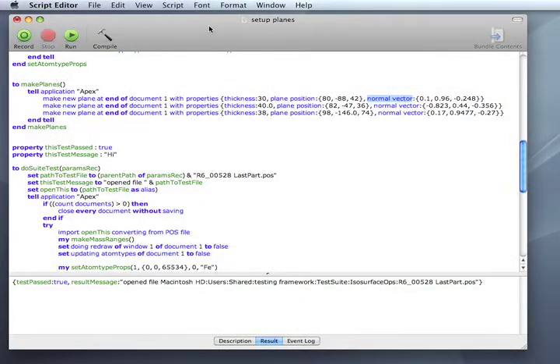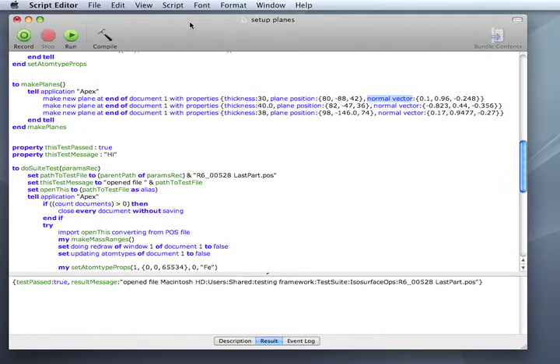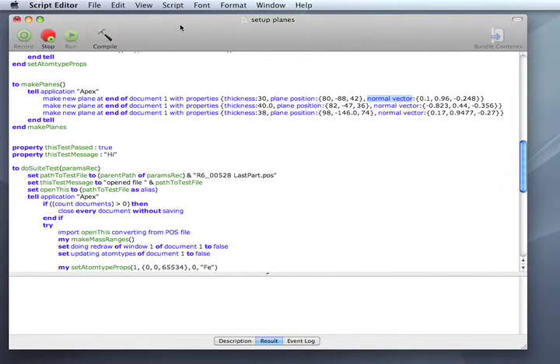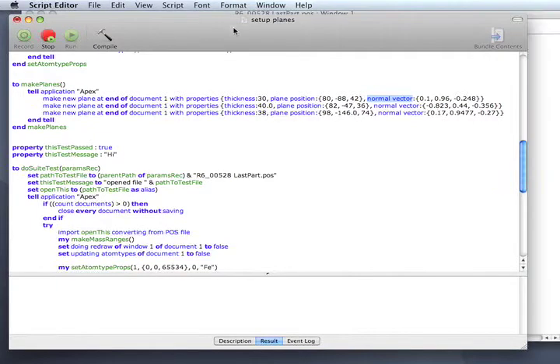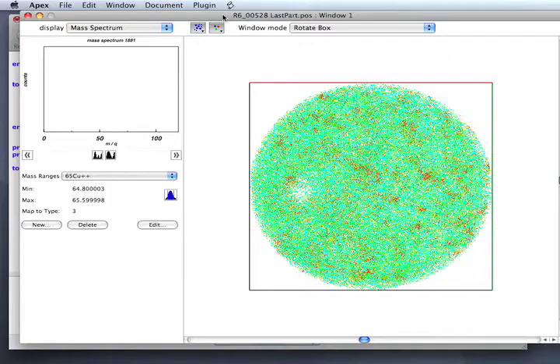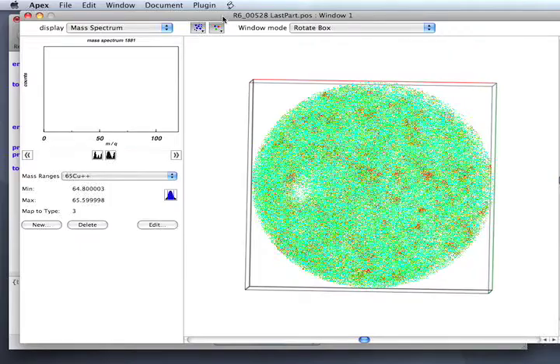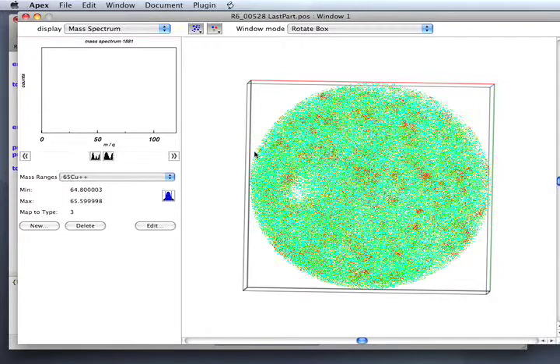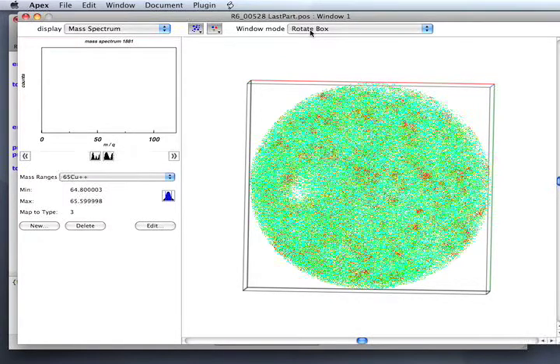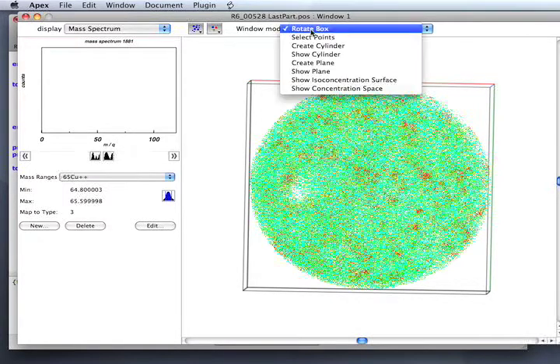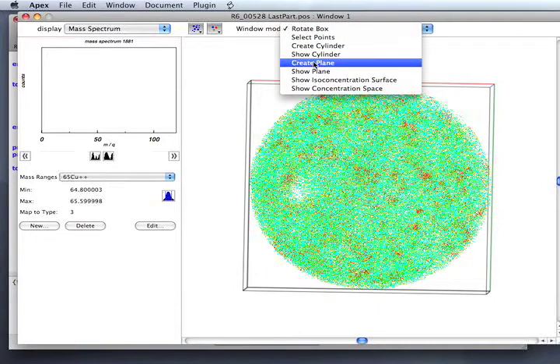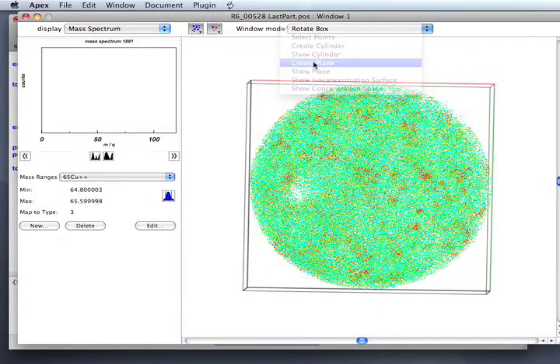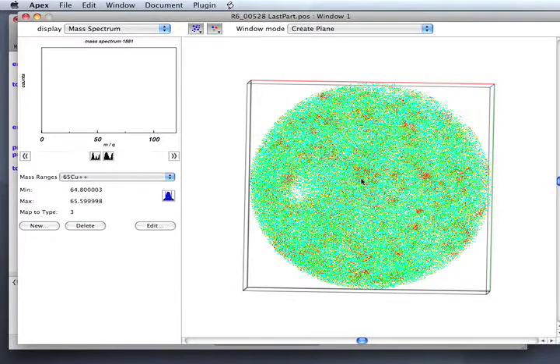I'm going to show off some of the new UI for manipulating planes in Apex Atom Probe software. I'm going to run this AppleScript to load a file and define atom types and mass windows. I'll go to the create plane item.